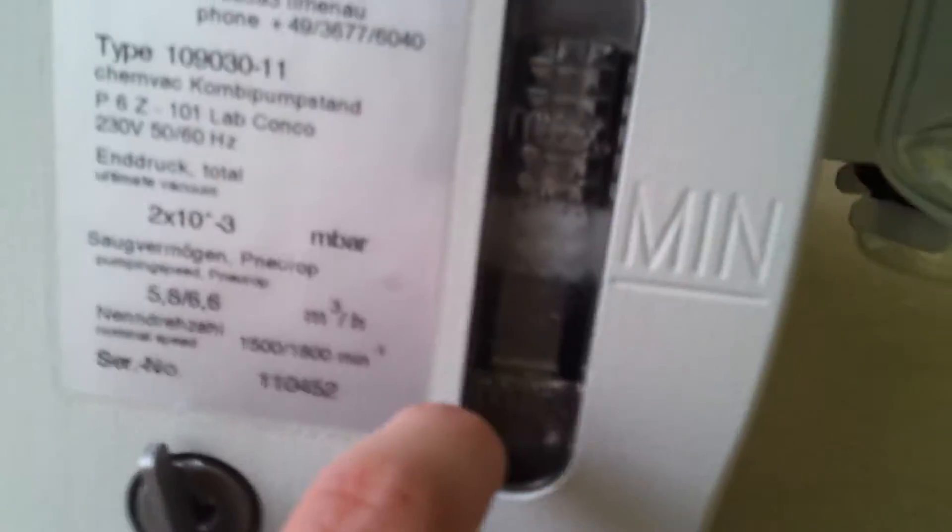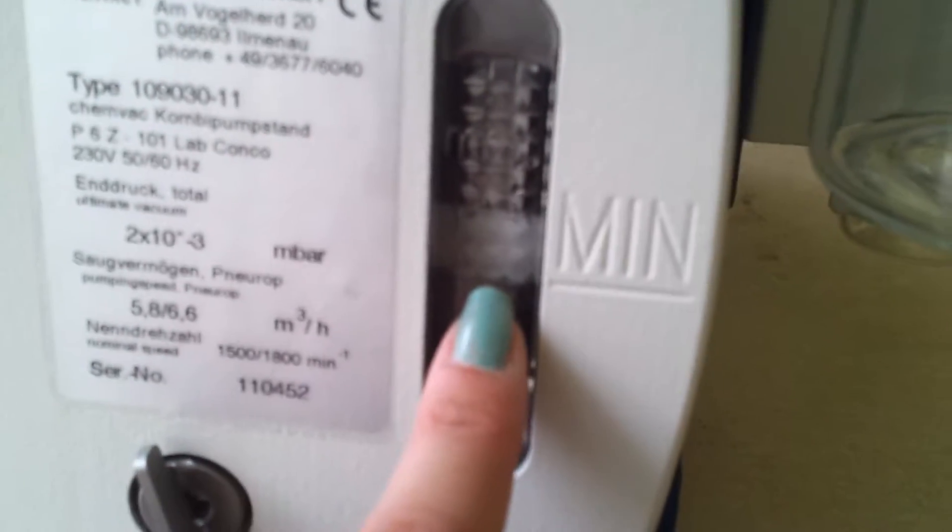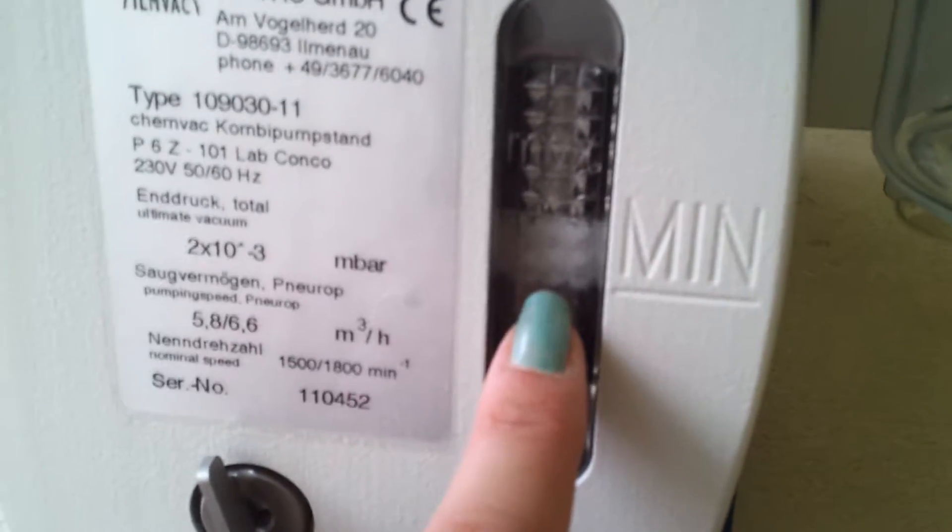We can see the oil starting to get bubbles and foam. What happens is the air bubbles capture contaminations from the oil and transfer them to this flask.